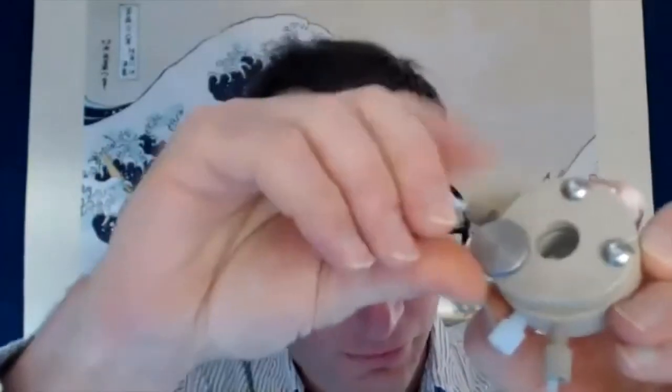There's a thumb screw on the front. If you take that off, you can get into the inside of the fReactor. There's a glass window, and then there's a little magnetic stirrer. Reassembly is just the opposite process. So if you need to get in and clean these things out, or after you've finished your reaction, you can do that and just reverse it. So it's very, very quick and easy to assemble and disassemble.